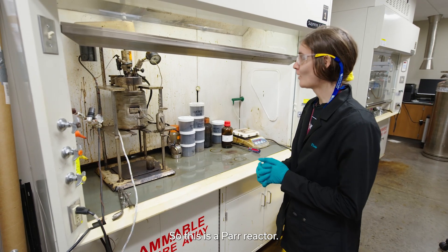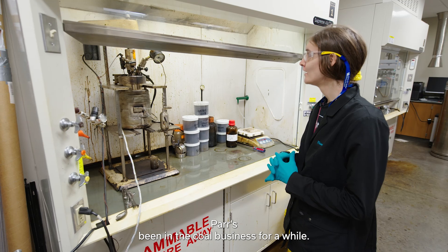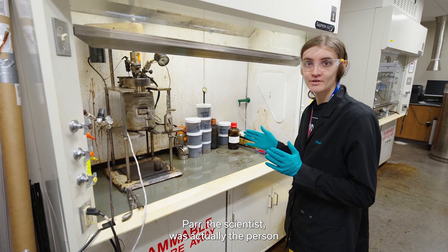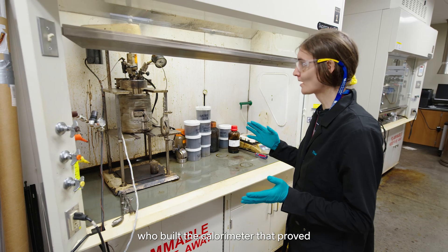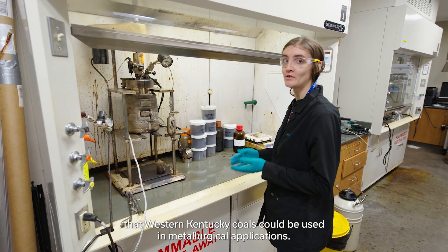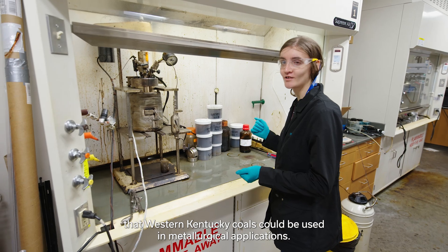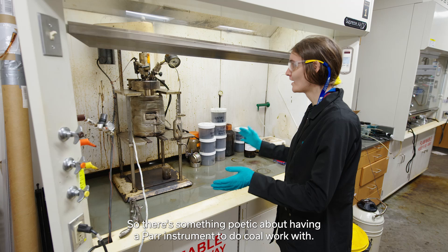So this is a Parr reactor. Parr has been in the coal business for a while. Parr, the scientist, was actually the person who built the calorimeter that proved that Western Kentucky coals could be used in metallurgical applications. So there's something poetic about having a Parr instrument to do coal work with.